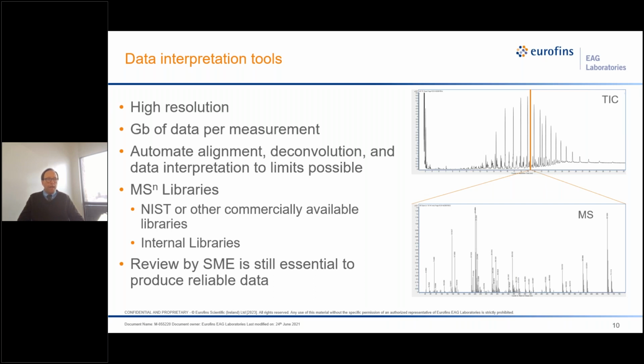The last comment I have on all of this, though, is that it's still essential to have subject matter experts reviewing this data to make sure that it is in fact reliable. The automated routines just aren't there to do it in an accurate manner without any external input.